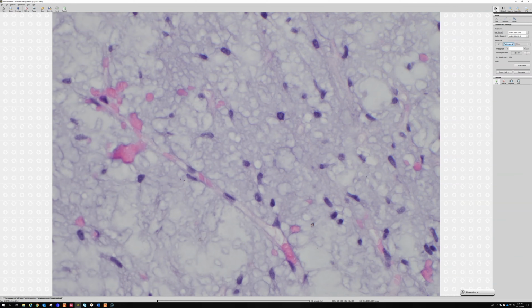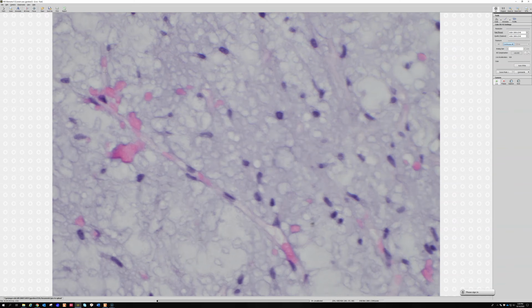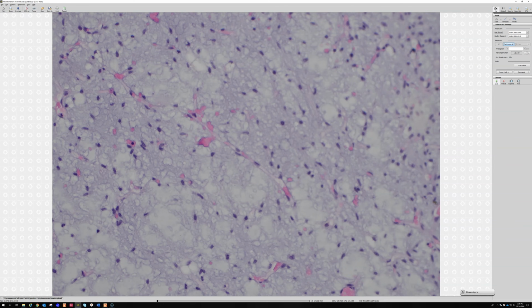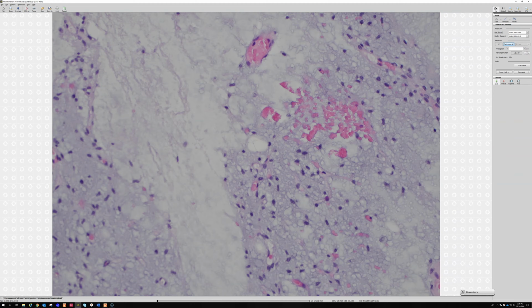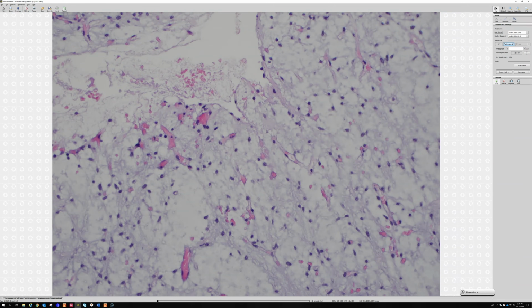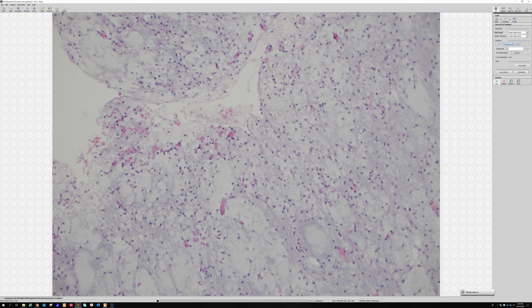It doesn't look anything like the rules we teach for malignancy. There are no mitoses. There's no pleomorphism. There's no necrosis. It's not even cellular, right? It's hypocellular, bland cells. This is the only one where recognizing the actual pattern of these bland cells in the myxoid background with these delicate branchy vessels is key. And if you look around, you'll usually find either some scattered mature fat cells or some little tiny signet ring looking lipoblasts. You're not going to see big pleomorphic lipoblasts like you think of for a liposarcoma.